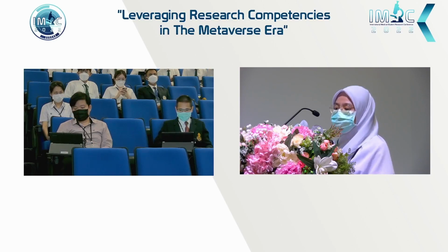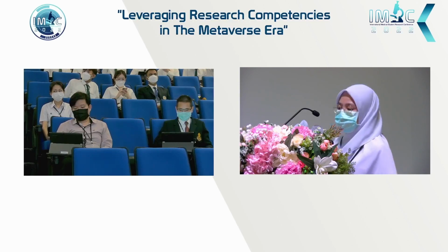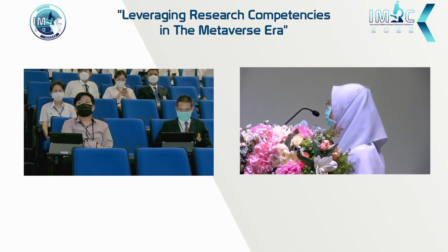For S. aureus, Pseudomonas aeruginosa, E. coli, and Candida albicans, we use the reference strain. Okay, not from the patients, right? The reference strains, not isolated from patients.